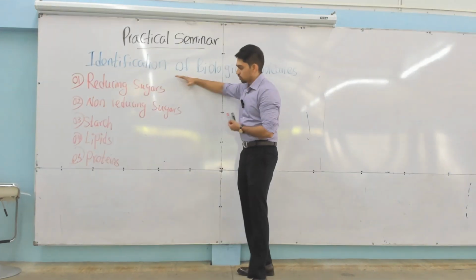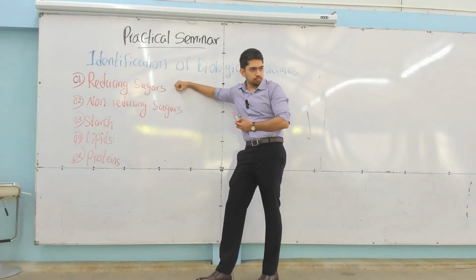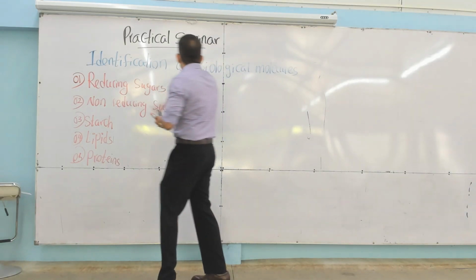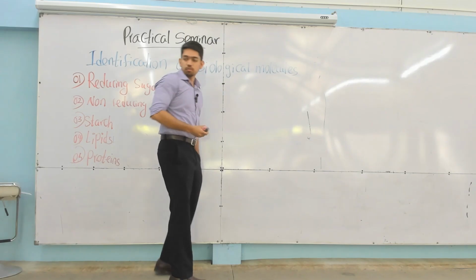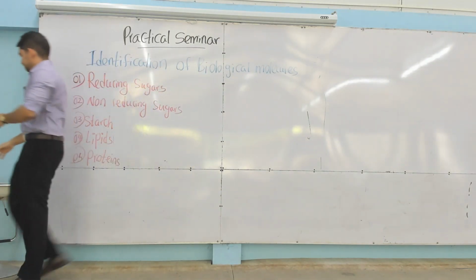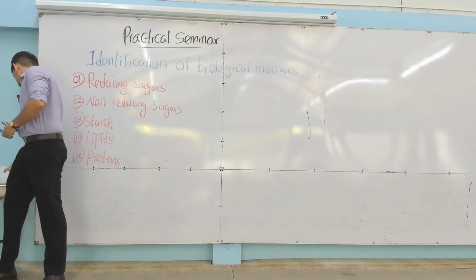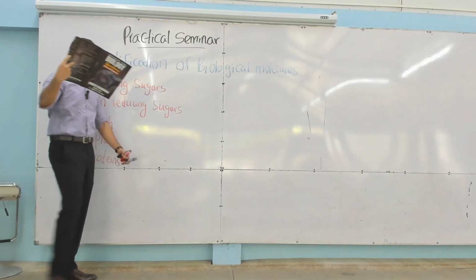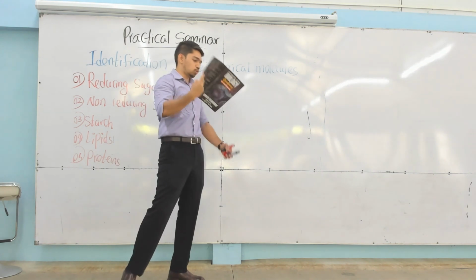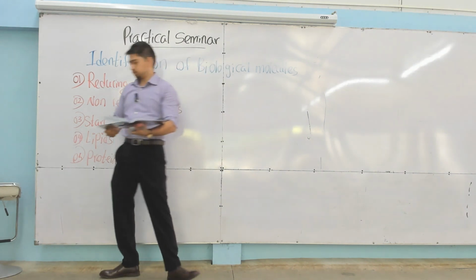So with the knowledge you have currently, we can do all these practicals. Right? So that's the first part. The second part of today's seminar is the microscope. Under the microscope, you have two practicals, that is identification of the parts and functions of the light microscope and use of the light microscope to observe specimens. So that is part 2.